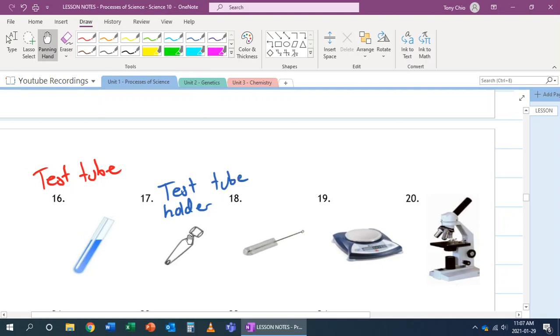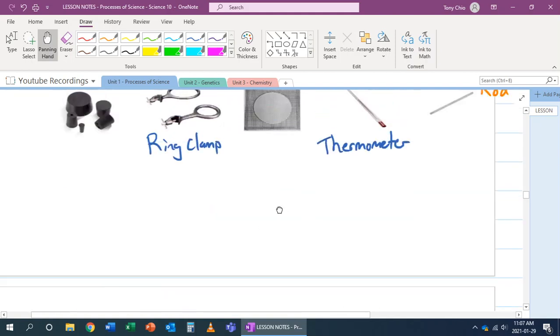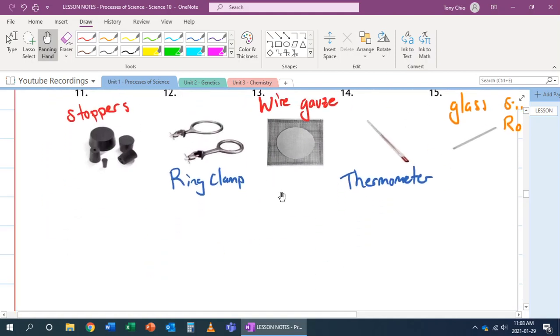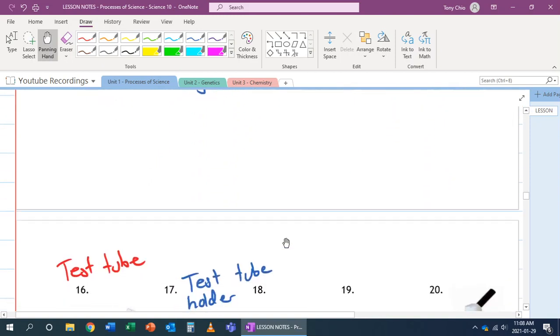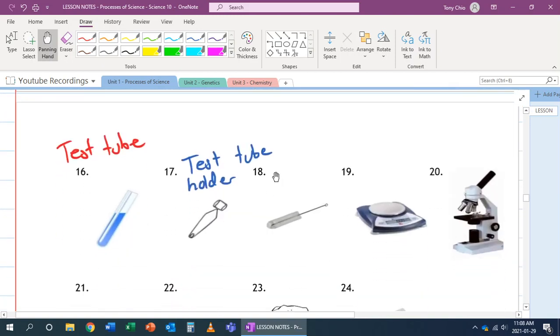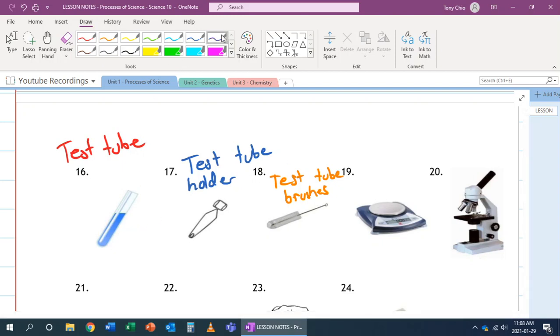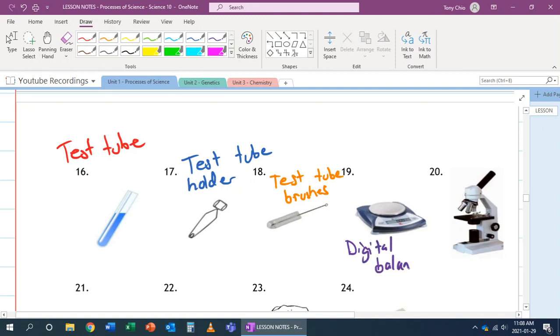So we use a Bunsen burner, and now we can hold the test tube and move it around. The reason why we can't use this is because this rubber tip will melt, actually. Number 18. Number 18 is called a test tube brush. It's used to clean out test tubes, because we can't actually get our fingers to clean the inside of this. Number 19. That's called a digital balance. It's used to find the masses of objects.